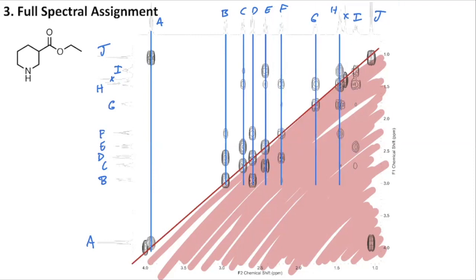So there's our vertical set of correlation lines. Most of them seem to run through cross peaks, particularly out here in the middle, but actually after putting in the lines at I and J, it doesn't seem like we run into any cross peaks here. We only hit the identity diagonal. So for simplicity's sake, I'm going to just go ahead and erase those annotations since they don't go through any cross peaks on the upper half of our graph.